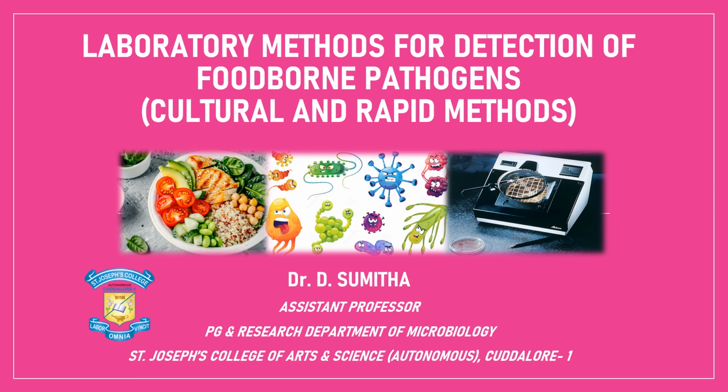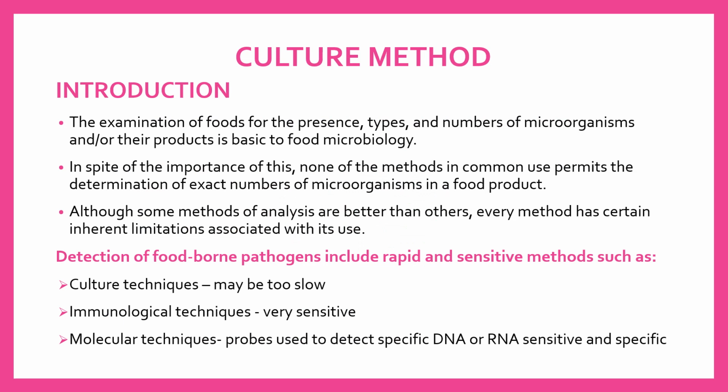Hi everybody. Now we are going to see about laboratory methods for detection of foodborne pathogens, conventional and rapid methods. First we will see about the conventional method, that is the culture-based method.